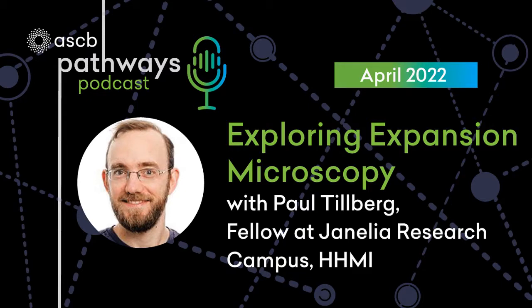And at some point, you come up against a very hard limit, which is that the distance between crosslinks in your material is filled by polymer chains that are just flailing around randomly. The conformation of a polymer chain is randomly sampling all possible conformations, i.e. not retaining spatial information. So if you make too loose of a network to begin with, and the crosslink to crosslink distance becomes 10 nanometers, then you're not going to have much hope of preserving any information below the 10 nanometer scale. Now, nobody has looked at that carefully. We don't really know what that distance is, but at some point you will come up against a hard limit like that.